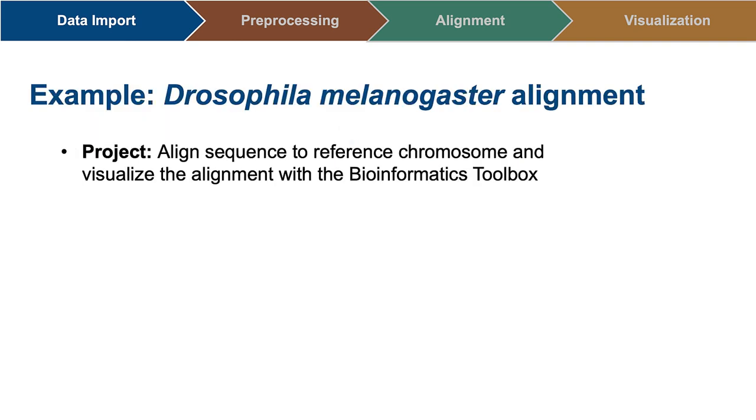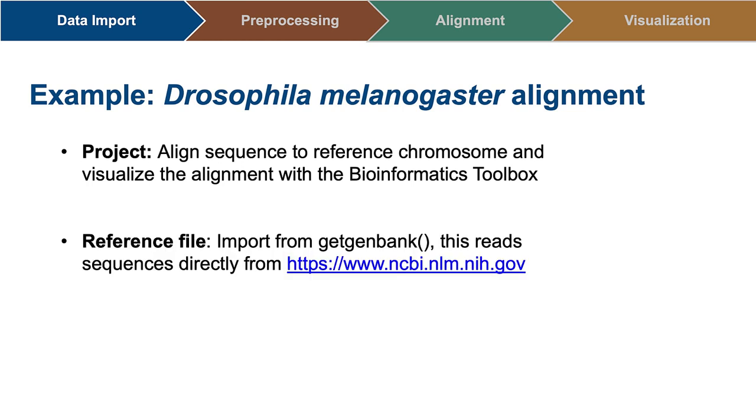Let's say we have sequencing data from a fly, Drosophila melanogaster. We'd like to align this data to the NCBI reference chromosome 4 in the MATLAB environment and visualize the results. First, I need to import my reference and sequencing files into MATLAB.